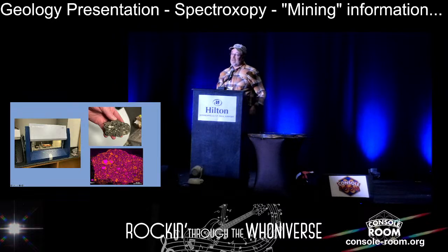Well, this particular student not only did all 3 rocks, but she wanted to know what that amygdule filling is. What is the mineral? The micro-XRF doesn't quite have the resolution that the SEM does. It's a really good tool, but it doesn't answer the question for us necessarily. We knew what elements to expect.